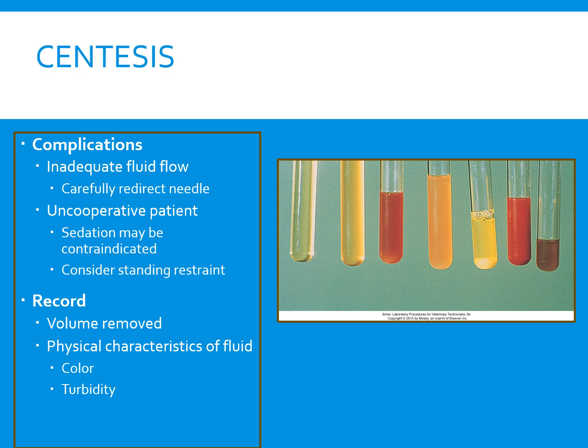Whenever we pull out fluid from a patient, we want to record the volume. And this is much like our other samples. The color, the volume, everything about the sample can tell us something about the pathology and what's going on here. If it's red, we could have hemorrhaging. If it's cloudy, that could be from inflammation and a lot of white blood cells present. So we always want to record the turbidity and the color and the volume of the fluid that we pulled out of the patient.